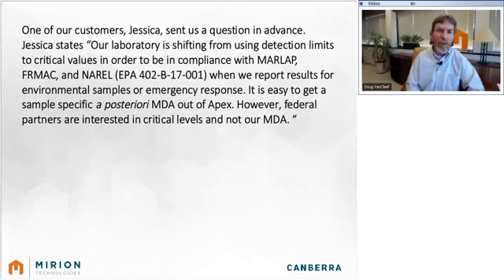The decision level is a core part of every a posteriori analysis and is calculated and stored with every result generated by Genie. For example, the decision level can be shown by running the standard ISO 11929 MDA report, which has a dedicated column for reporting the decision level. There are other ways to do that with other MDA reports, but that's the simplest. So the information you're looking for is there. The trick is to make sure you configure your report to display that information.